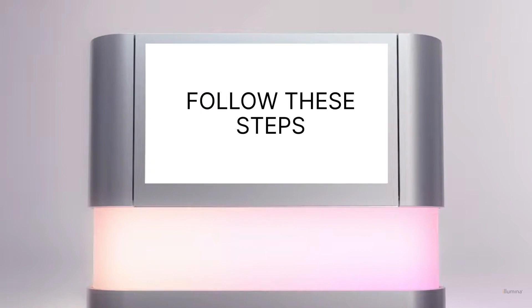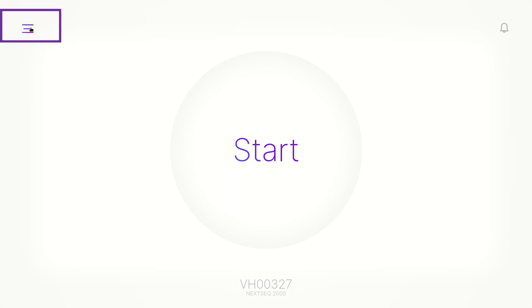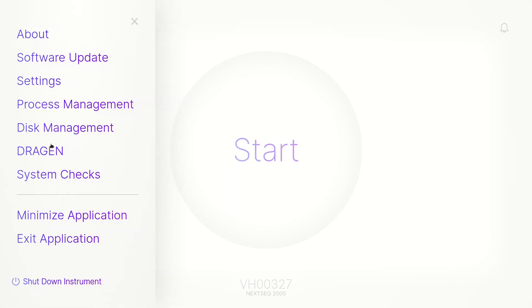Complete the following steps to perform the system checks. From the control software home screen, select the menu icon in the top left corner, then select System Checks.